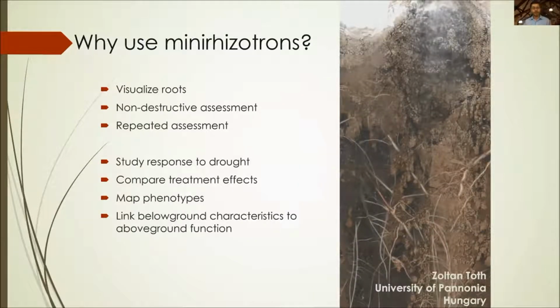So getting back to root study, a lot of studies are actually destructive of the roots, which has a hard effect on being able to visualize the roots in their natural biome, do a non-destructive assessment, see how they grow, and do a repeated assessment over time of growth, application studies, and pathogens. Since their proposal by J.H. Bates back in 1937, minirhizotrons have been constructed with a successive list of technologies, starting with just mirrors, in order to visualize roots and provide a means to non-destructively and repeatedly assess root conditions.